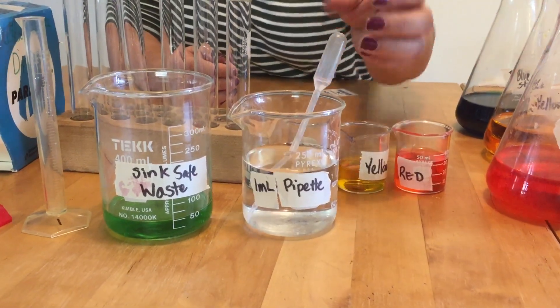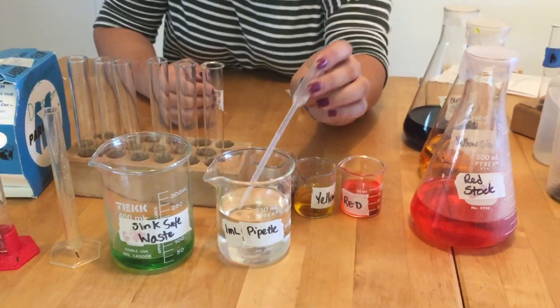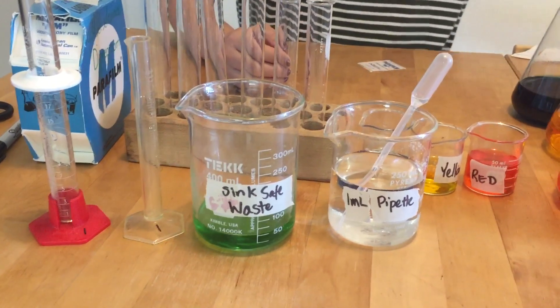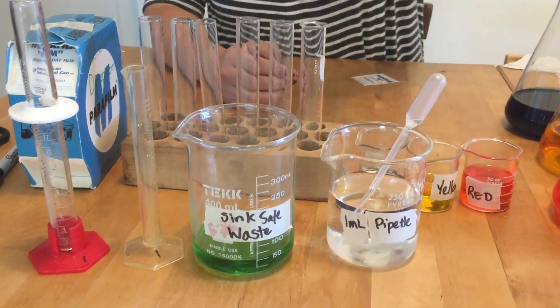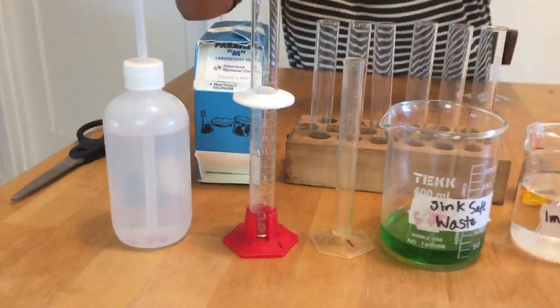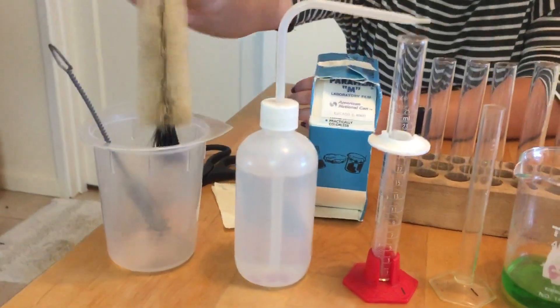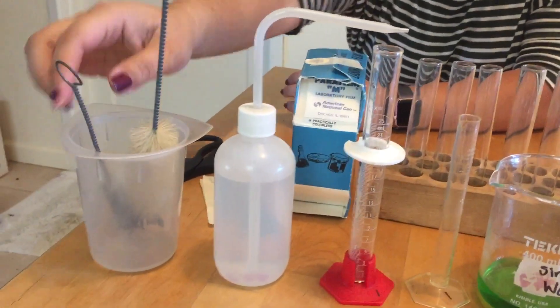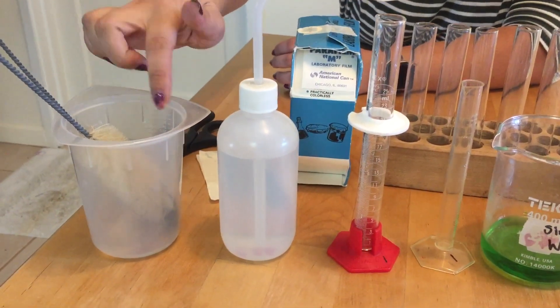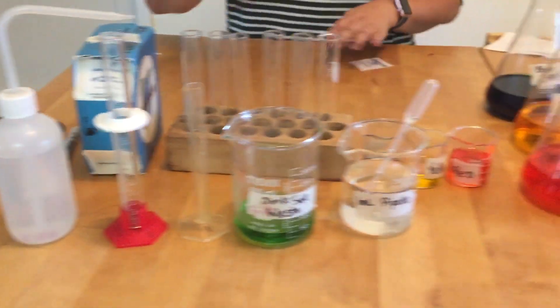We have a 250 ml beaker that will hold water for your 1 ml pipette for rinsing later on, and a 400 ml beaker. You're going to need a wash bottle to help wash out the test tubes, a bottle brush for washing the larger beakers if needed, a test tube cleaner, and ideally dishwashing liquid. That's the materials you'll need.